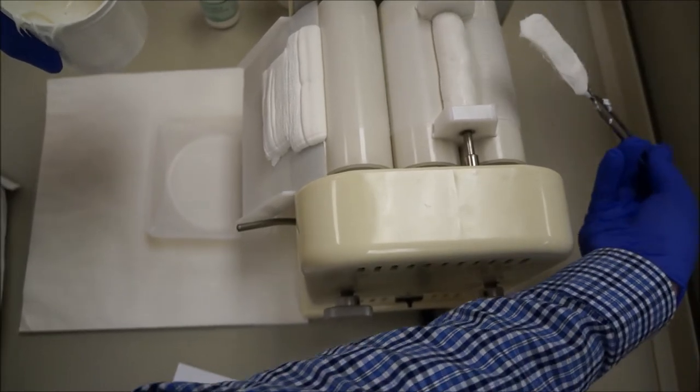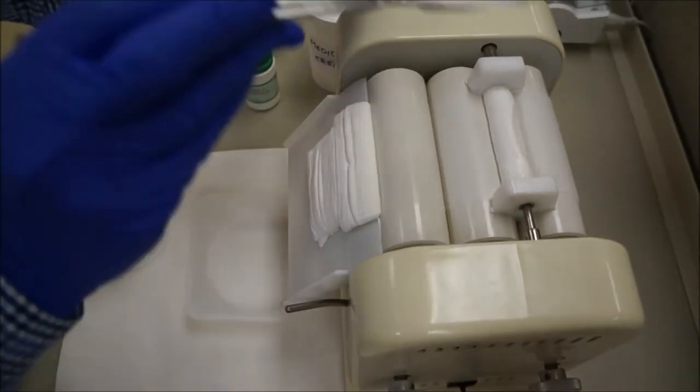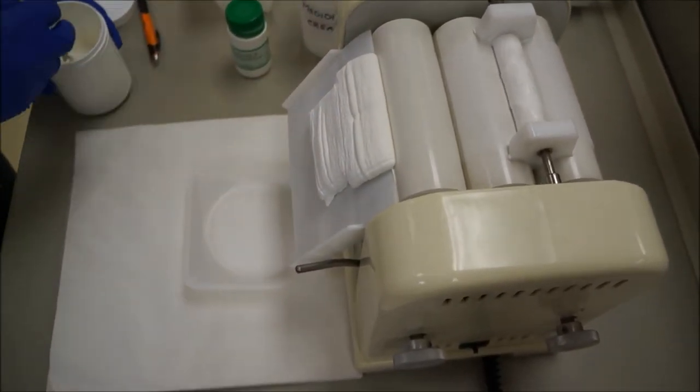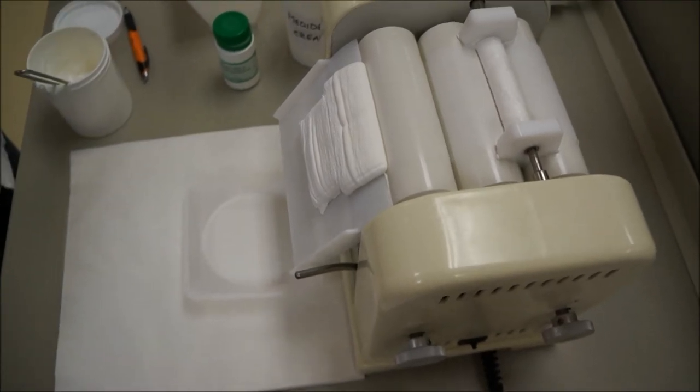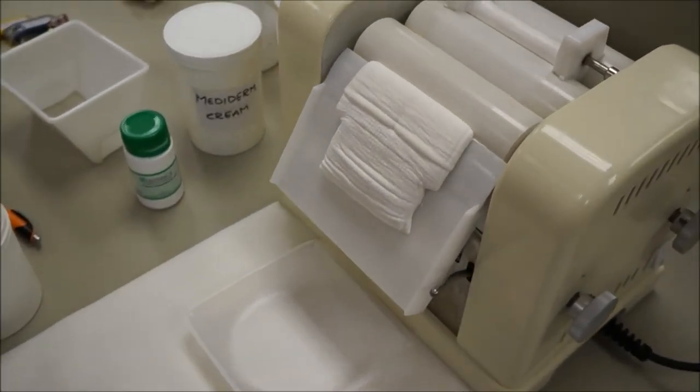As you can see, my spatula has some on it. You scrape it off on that way. You never stick it straight in. You stick it straight in, it will get caught in the rollers and it will ruin your machine, possibly suck your hand in. So you always scrape it off on the back side of the rollers.